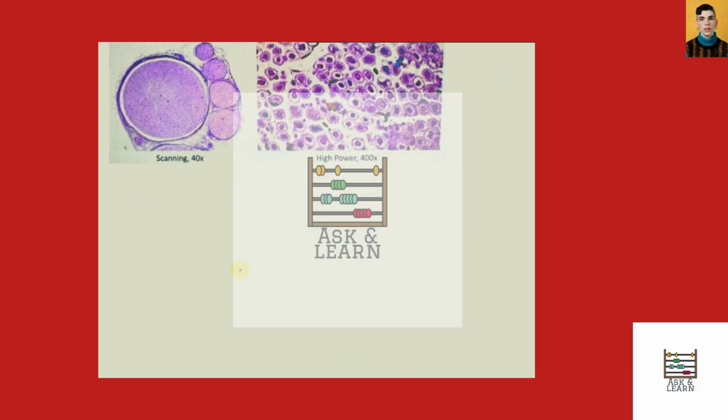Another question regarding these diagrams is, are cell bodies and nuclei of any neurons, nerve cells visible in this picture? Why or why not? The cell bodies and nuclei of neurons are not visible in this picture or diagram of the peripheral nerve.